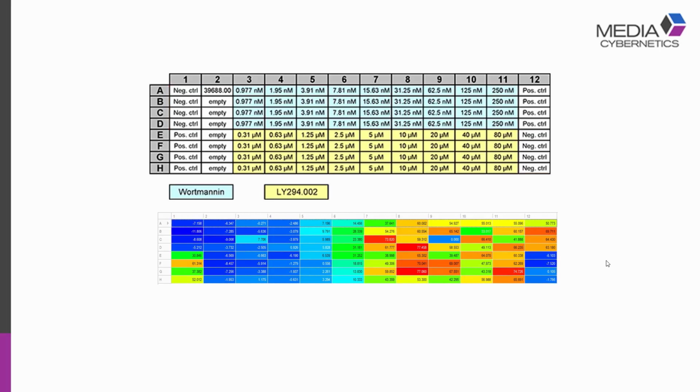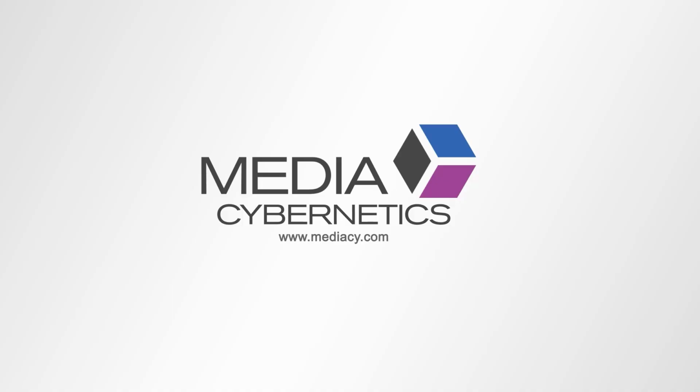And if we look at the whole plate, on all of these rows A to H, we're showing agonist increase between columns 3 and 12. And this is reflected in our heat map by an increasing difference between the nucleus and the cytoplasm, between columns 3 and 12. So it's a really nice confirmation that we're seeing exactly what we expect to see using our protocol. So that brings me to the end of the video.